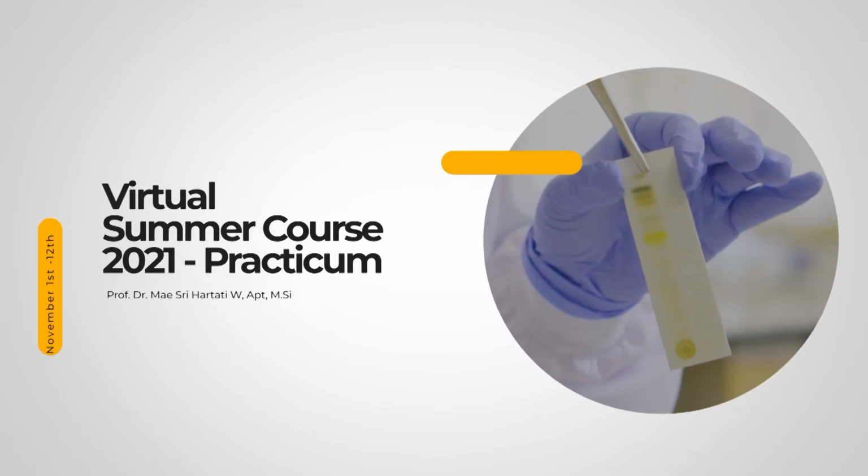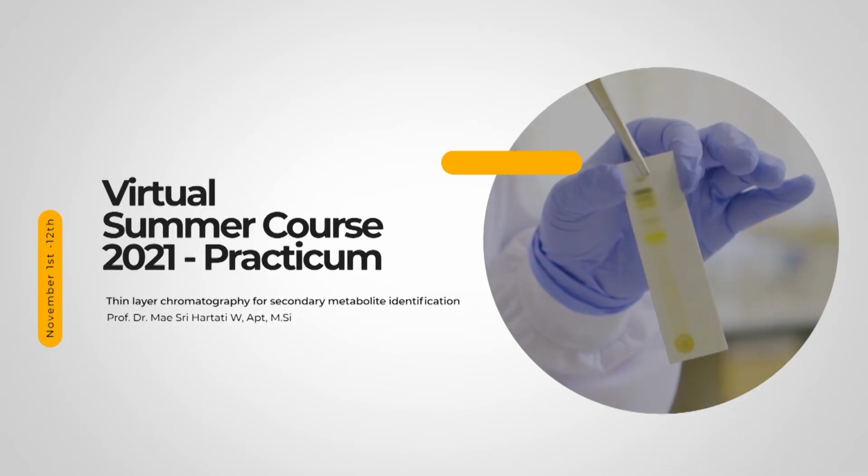Thin layer chromatography for secondary metabolite identification.